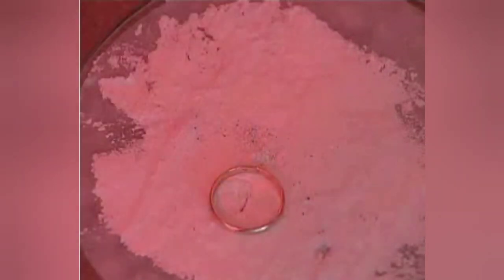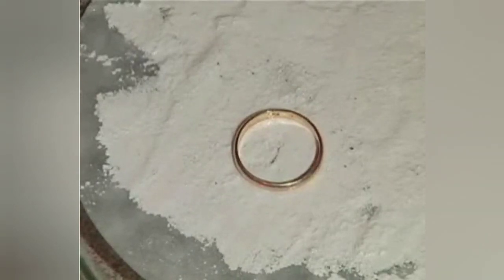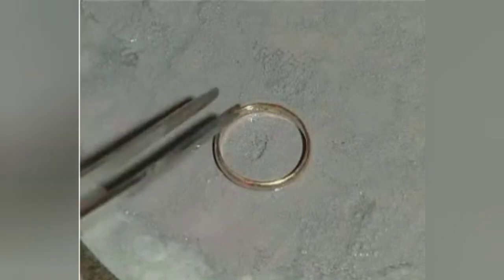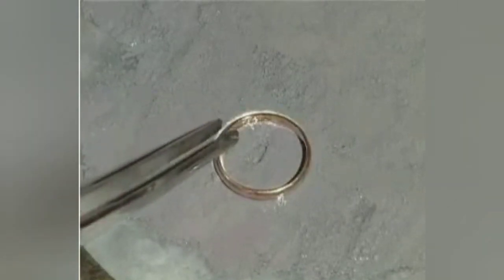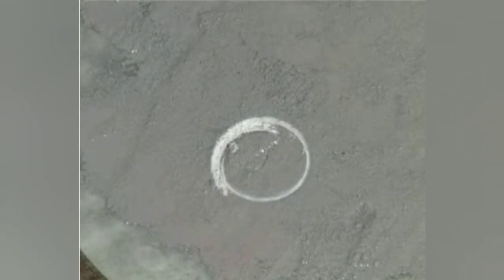We put an object on the filter paper to cover part of the substance. We transfer the whole to a well-lit place. After a few minutes, we remove the object covering the filter. The area previously covered by the object has not changed color, whereas the surface exposed to light has darkened visibly.